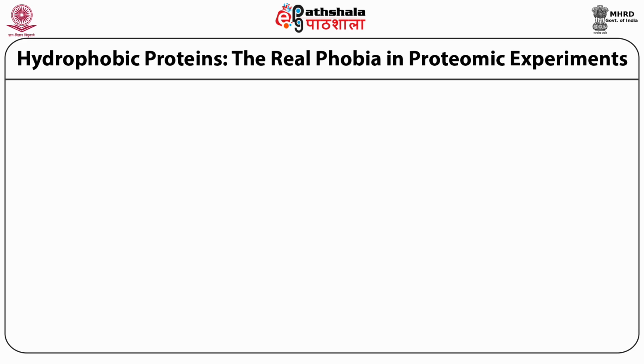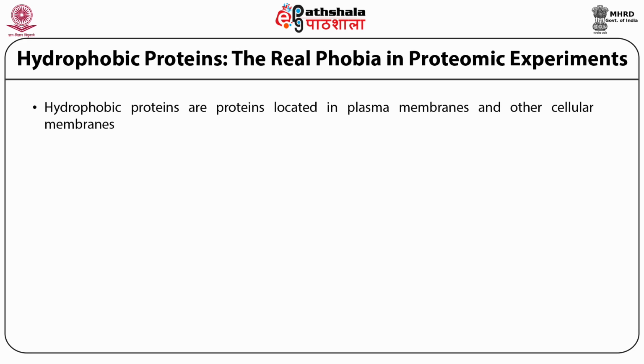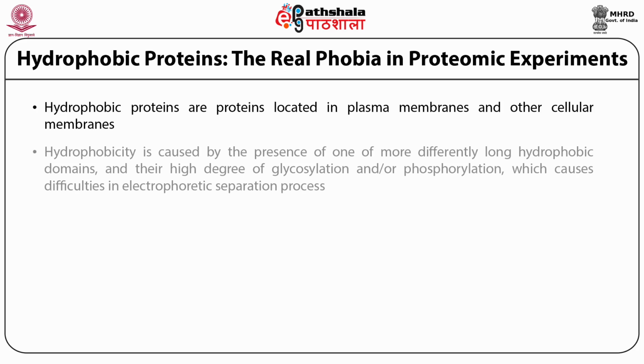Hydrophobic proteins are a real phobia for researchers in proteomic experiments. Hydrophobic proteins are proteins that are located on plasma membranes and other cellular membranes. Hydrophobicity is caused by the presence of one or more long hydrophobic domains, and their high degree of glycosylation along with phosphorylation causes difficulties in the electrophoretic separation process.